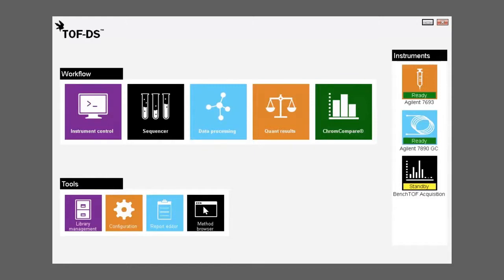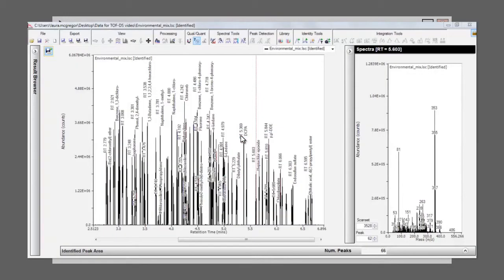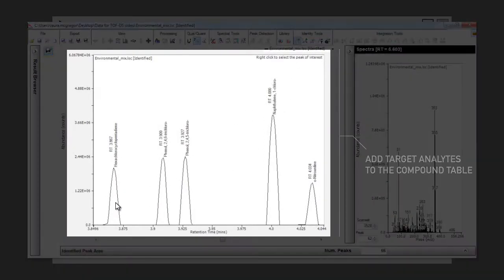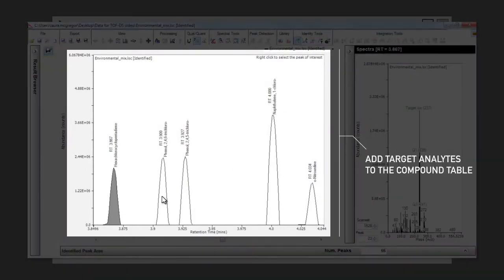Qualitative to quantitative workflow can often be quite time consuming and frustrating for analysts, so TOFDS simplifies this process as much as possible. To begin building a quant method from the data processing window, the peaks of interest are firstly added to a target table.